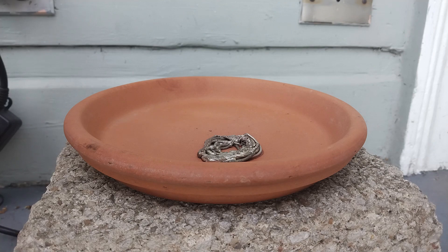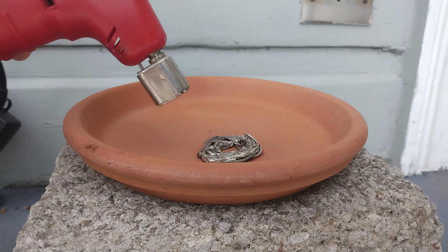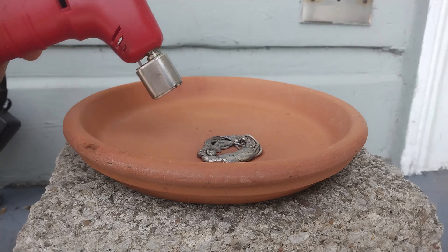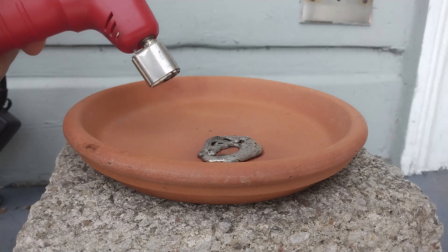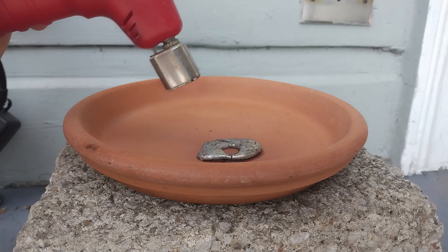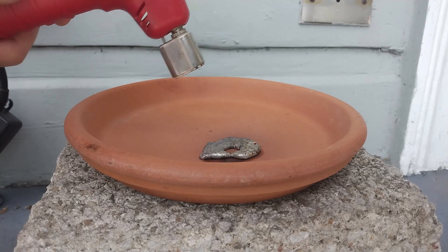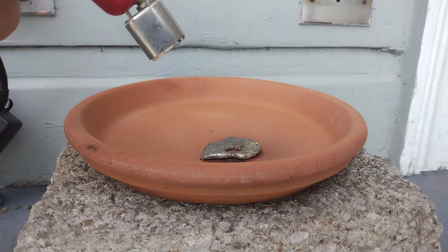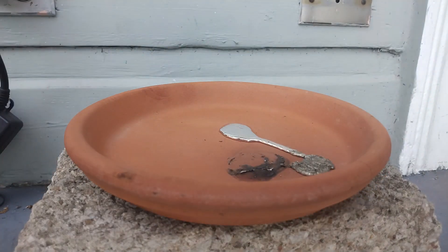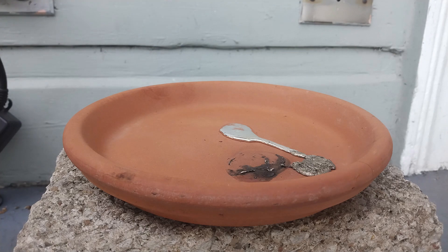My heat gun is not powerful enough, so I'm simply going to use my torch — much faster. There is some oxide that forms on the solder and we don't want it. I'm going to show you how to get rid of that oxide. The pot just cracked. To get rid of the oxide, just shake it — and here I have some really shiny solder without the oxide.